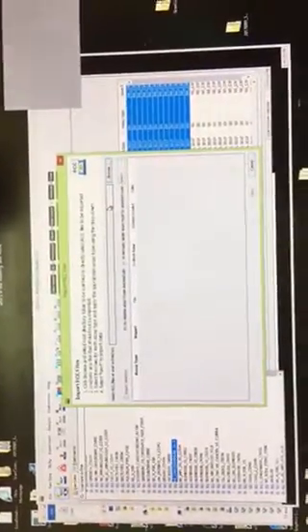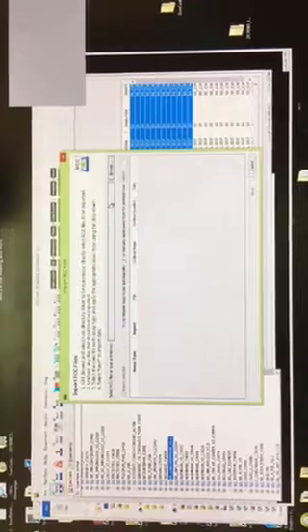Yeah. The RLF, yes and no. The RLF is needed for the scan. So you need to upload the RLF to the digital analyzer, and if you'd like to do an advanced analysis, you also need to import it into the NSolver program. Does that make sense? So you already have the RLF file, because you import that into the scan already.